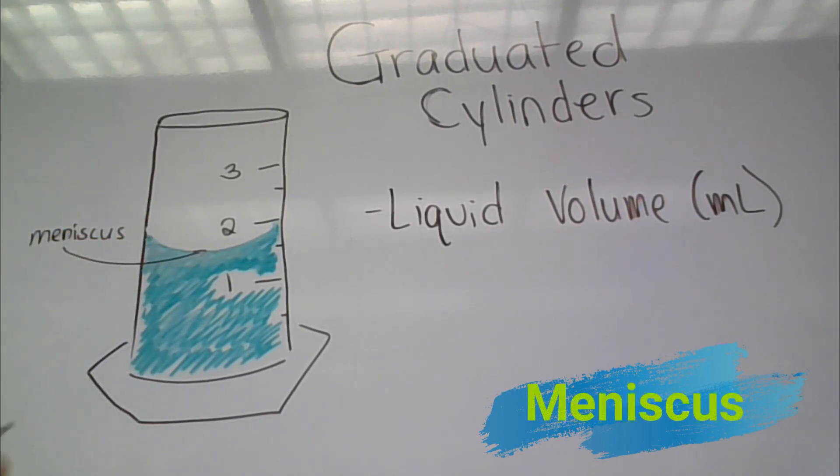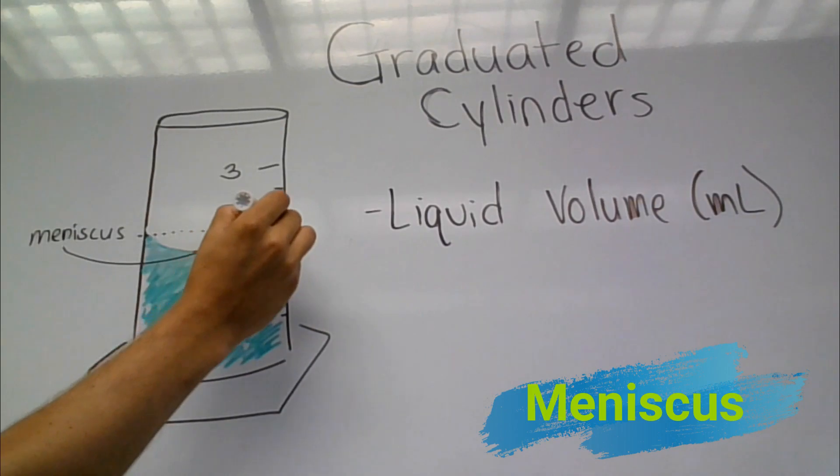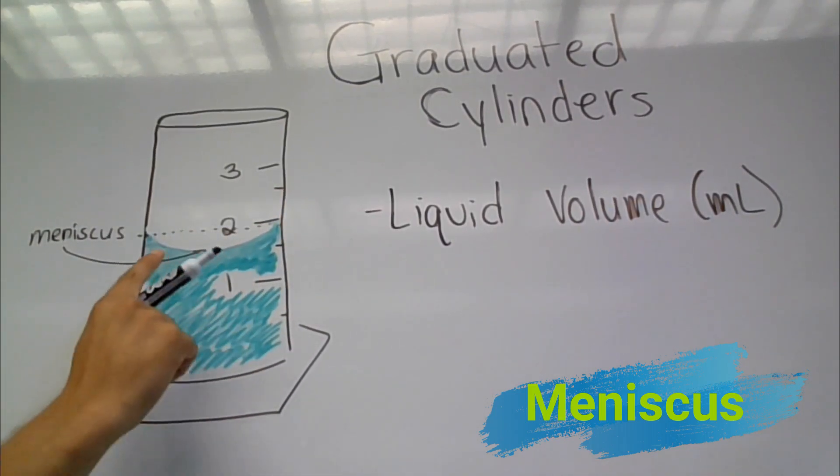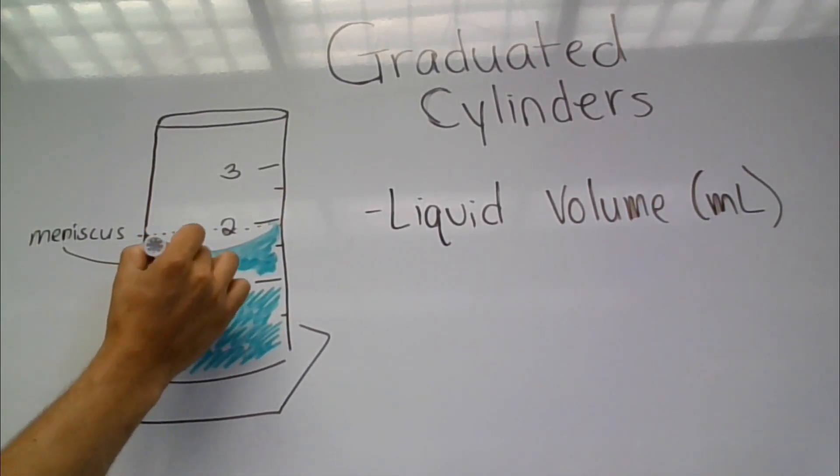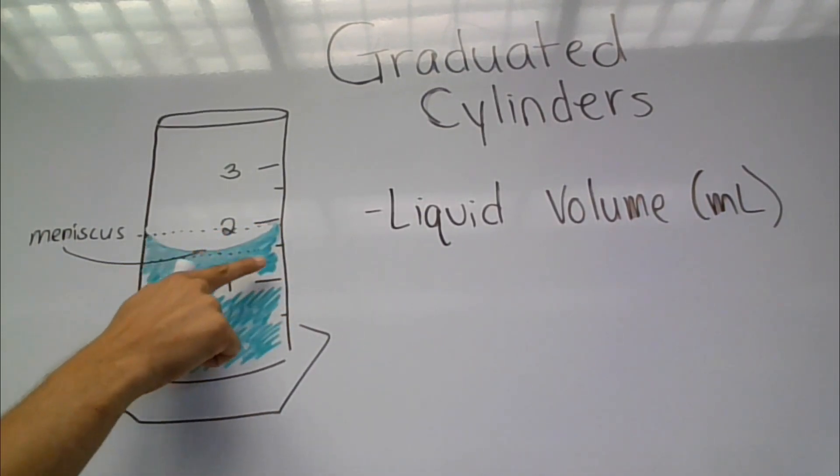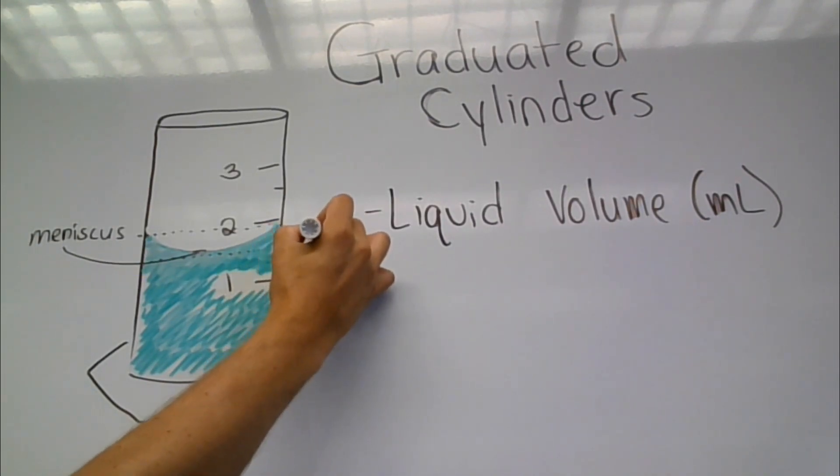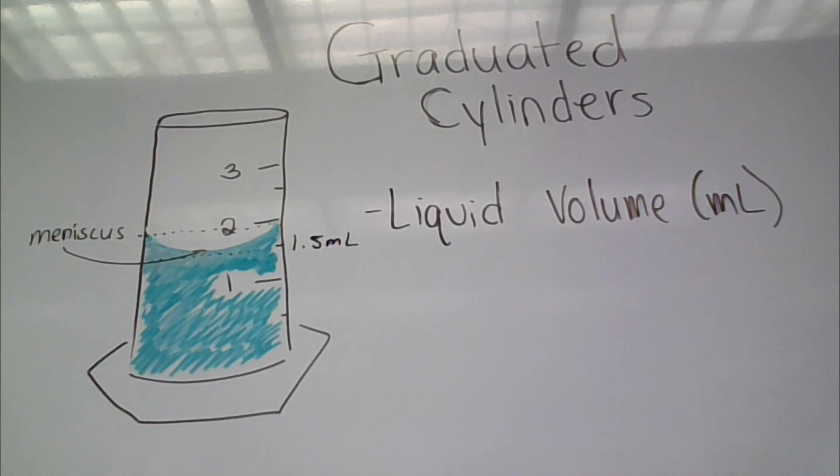The high part is at two milliliters, however that is not the measurement we want. We look at the bottom. If we make a dotted line across here, we see it's between one and two, and there's a little half mark, so it's actually going to be 1.5 milliliters. Be very careful looking at your measurements.